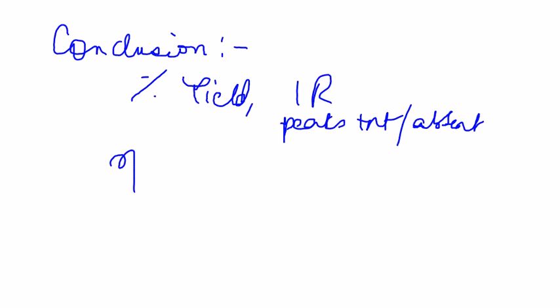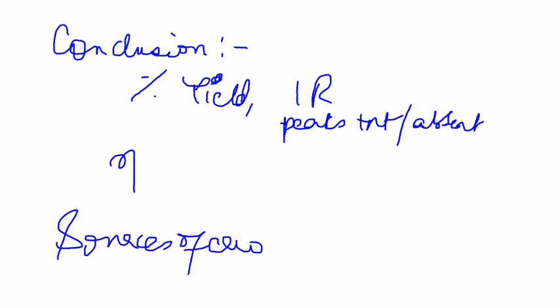What else? You're also going to give me what your sources of error were. Sources of error. And that will be it. That will be a lab. It's a pretty straightforward, sweet and simple lab, but just depends on how well you get your data together.